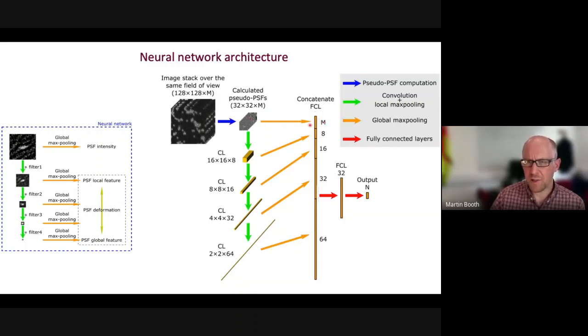And this is a very unusual architecture. We've basically concatenated all of these neurons in the neural network from each of these convolutional layers. So these convolutions down here are essentially what access the different scales of the image, and then the outputs from those go into this one fully connected layer here, side by side, and then that goes through to another fully connected layer and to the output. This is a bespoke neural network structure which has been designed specifically to solve this problem.